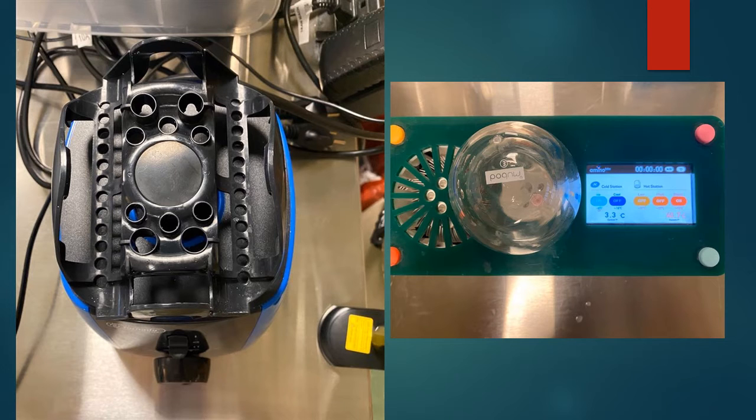The machine on the left is the vortex machine, used to mix the contents of a centrifuge tube. Meanwhile, on the right is a transformation machine, used to place a centrifuge tube at certain temperatures for periods of time.